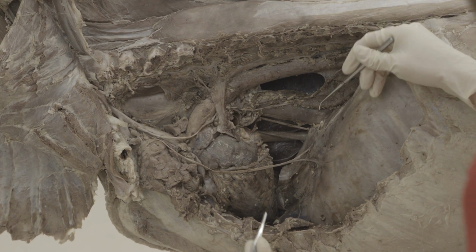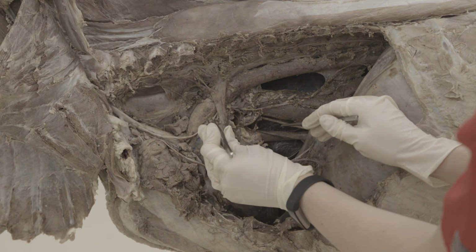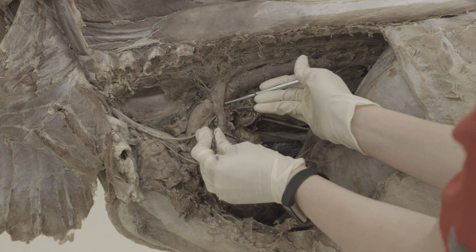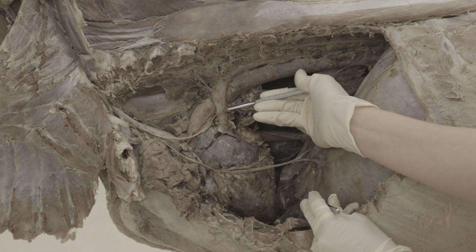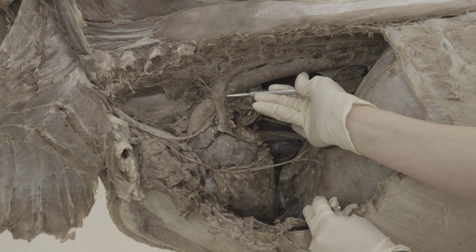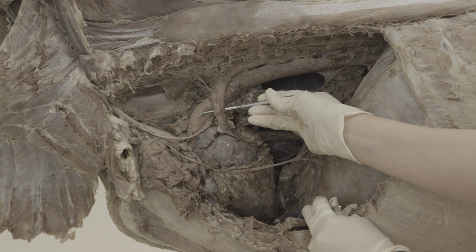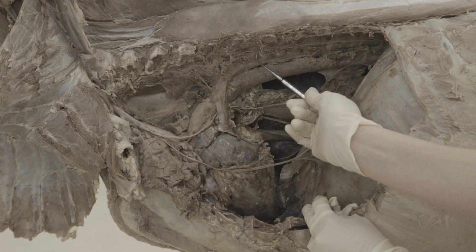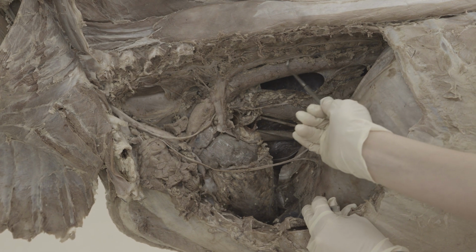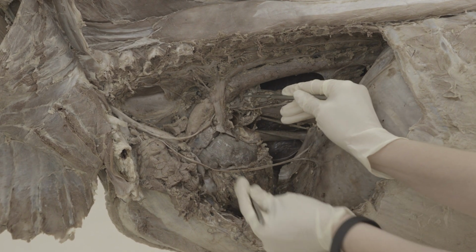So then we'll take a look and follow our vagus nerve caudally. The vagus nerve, you'll see, runs underneath this vessel, which is going to get in your way as well. In the calf, you have a left azygous vein as well as a right azygous vein in most specimens. The left azygous vein is here, and it runs up here along the spine, right there. That will kind of get in your way, so you'll have to work around that.